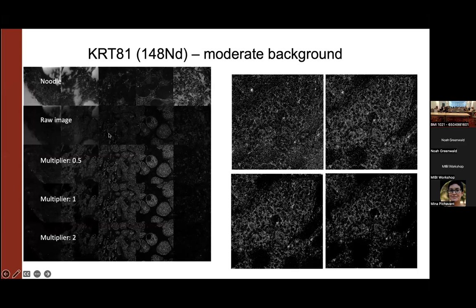Yeah, so a couple people commented on the fact that it's not just the noise that's being removed in the Rosetta process, but the images actually look a little smoother, like higher signal than noise. That's because we apply a very small Gaussian blur to the images prior to doing the Rosetta step.